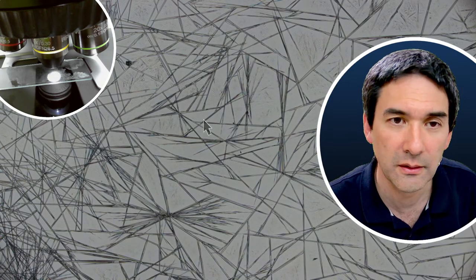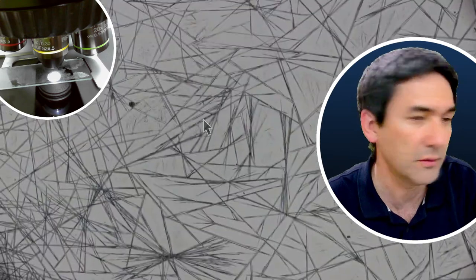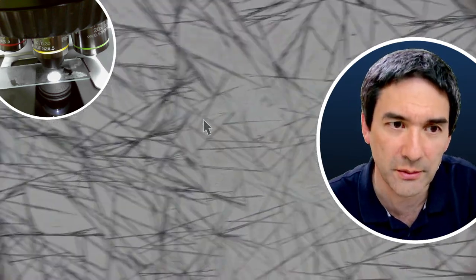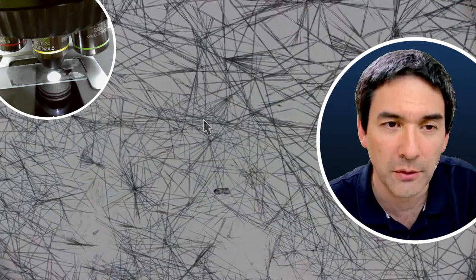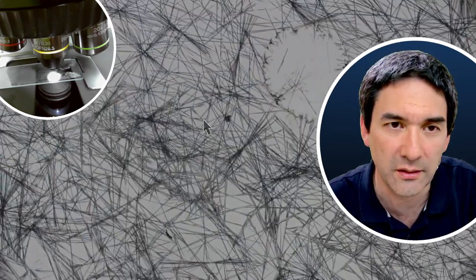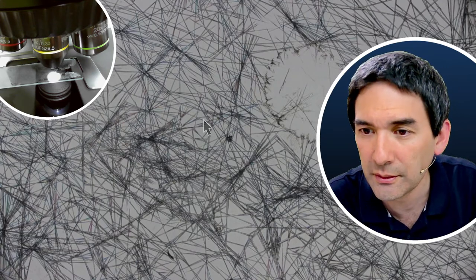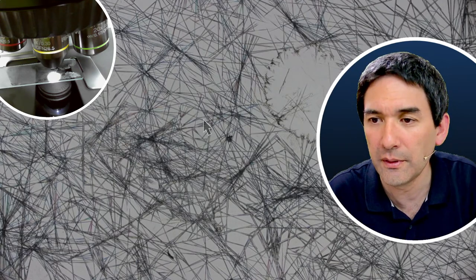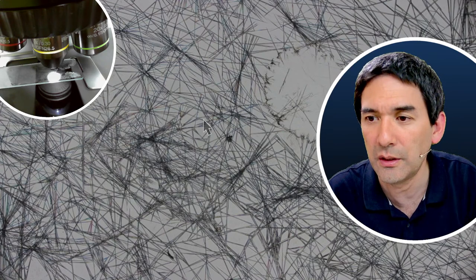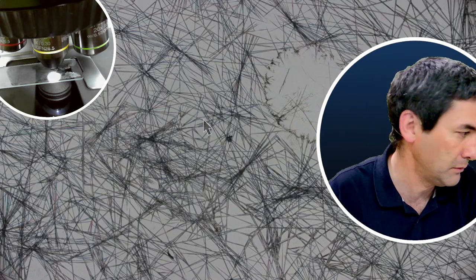Okay. So we don't have as many colors here. I think it also looks nice, but usually crystals look especially beautiful under polarized light. But that is bright field now. Okay, can you zoom in to the max? Okay, I will do that.